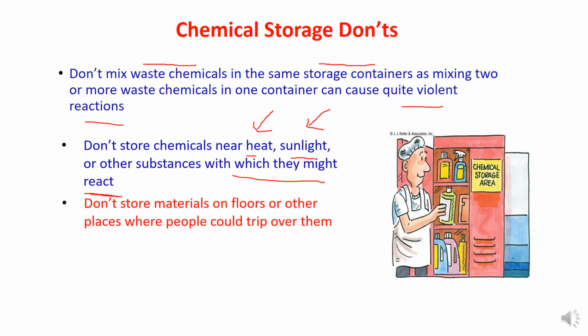Don't store chemicals on floors or other places. Only store the chemicals in the specified areas, in the storage, in the yellow cabinets, in the poisonous places. Each lab has its specified area. Once you start working in that particular lab, this is the first thing you check. It takes about one week to understand the lab: the setting, the storage, the working benches, the equipment, these things.